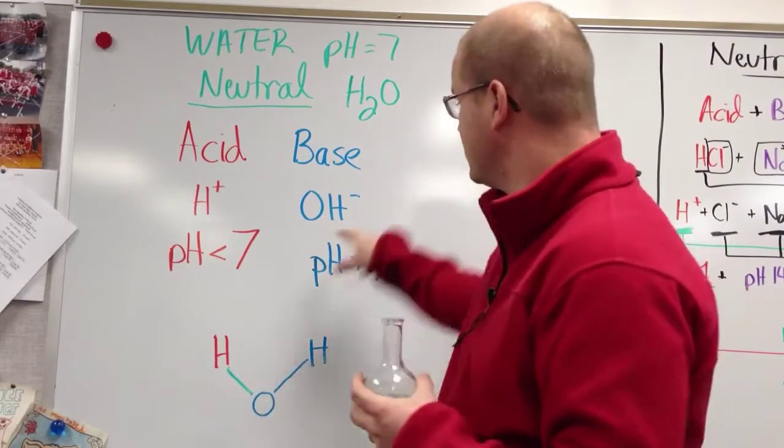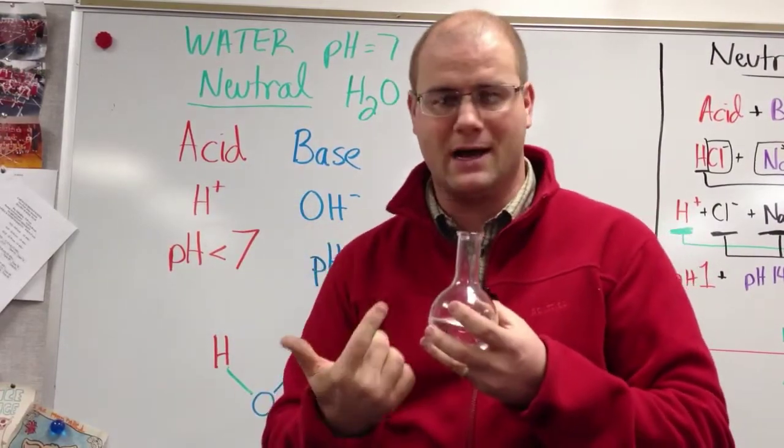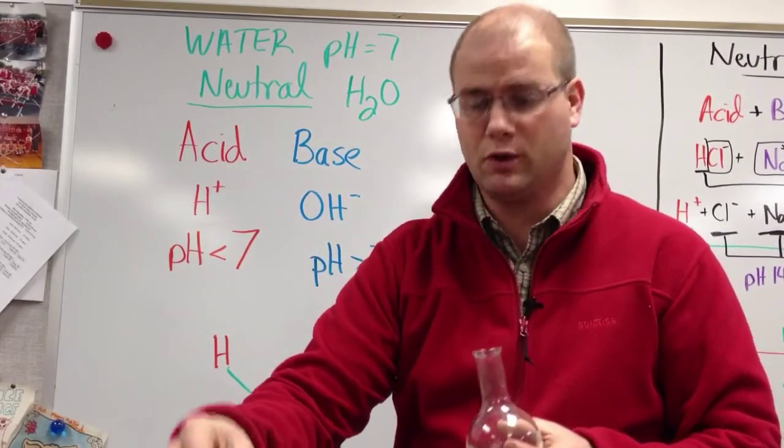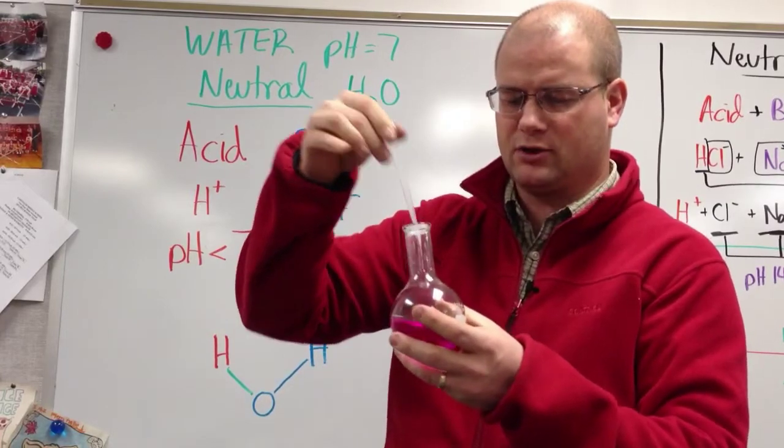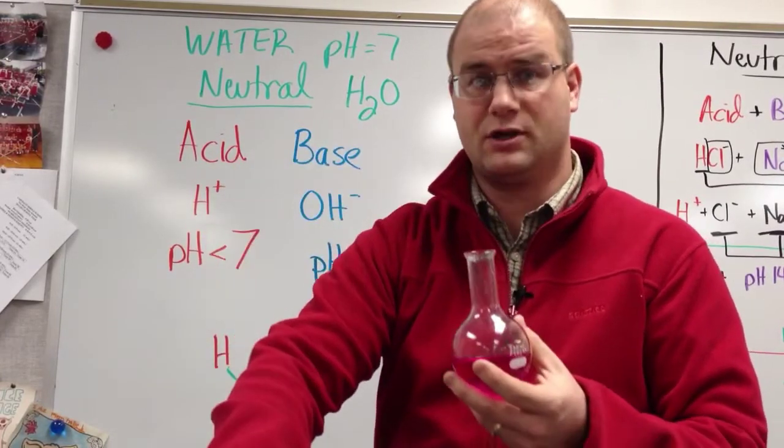Phenolphthalein only indicates the presence of this guy. So as long as I have an acid in here, I'm not going to see a color change. So I'm going to take some base, in this case sodium hydroxide, and I'm going to squirt it in there. And you can see the color change.